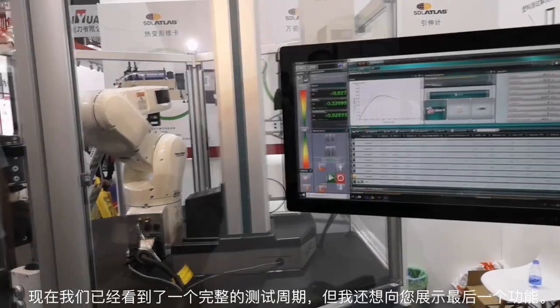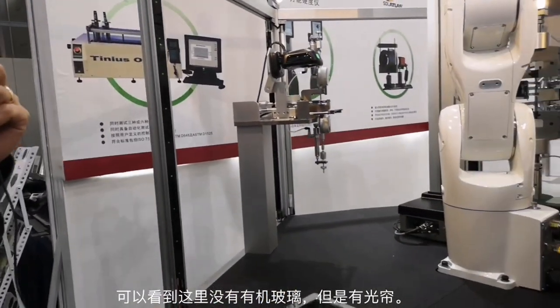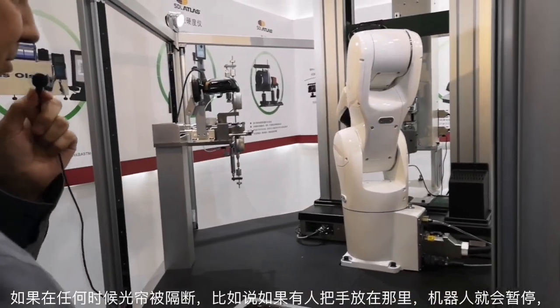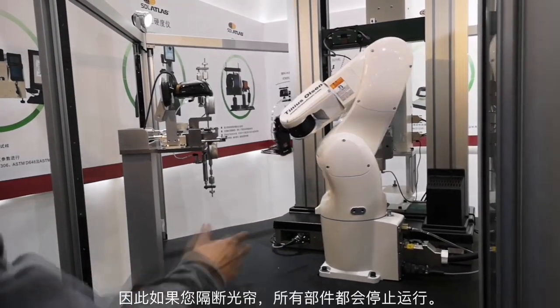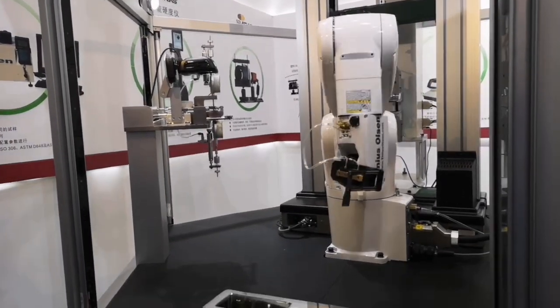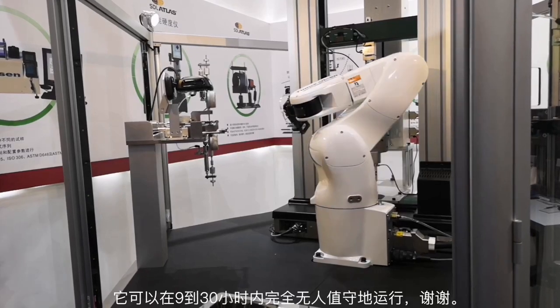Now that we've seen one complete cycle, I'd like to show you one last feature. You'll notice there's no plexiglass around here — we have light curtains. So if at any time the light curtain is broken, say if someone puts their hand in there, it will pause the robot. There are no moving parts if you break the light curtain. That is one complete cycle of the automation system. It can run anywhere from 9 to 30 hours totally unattended.